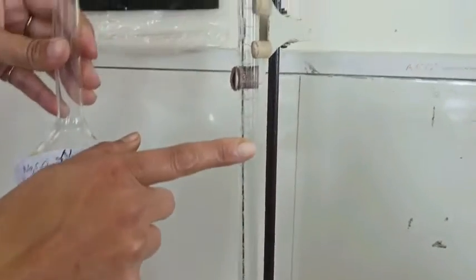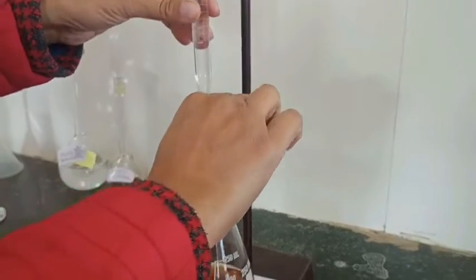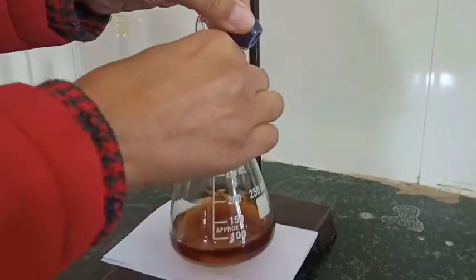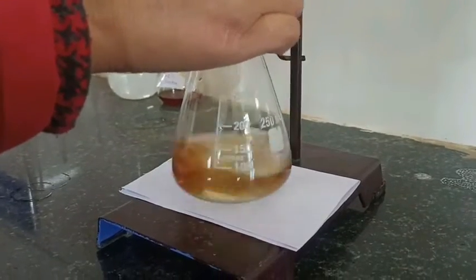The N by 10 solution is filled in the burette, and its initial reading is 0. Now we are going to titrate this iodine and vitamin C solution against the sodium thiosulfate solution.